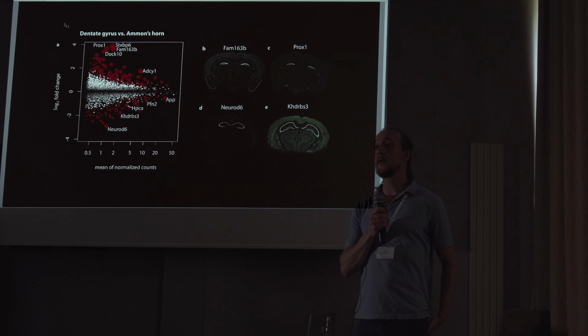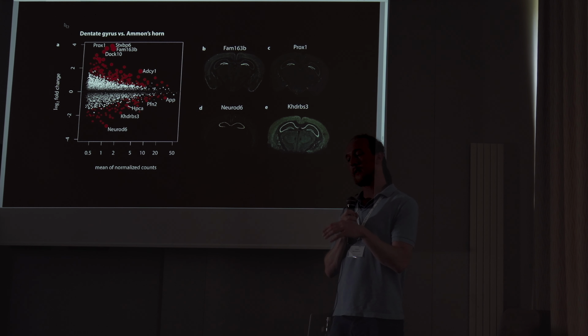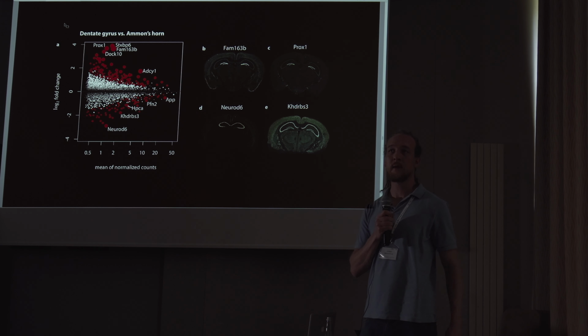We don't actually use our own parameters here. The way that this workflow works is we model the data and we end up with classifications for the spots, and then we select those spots and go to the original data to input that into DE-seq, providing it with the same covariate information that we have.